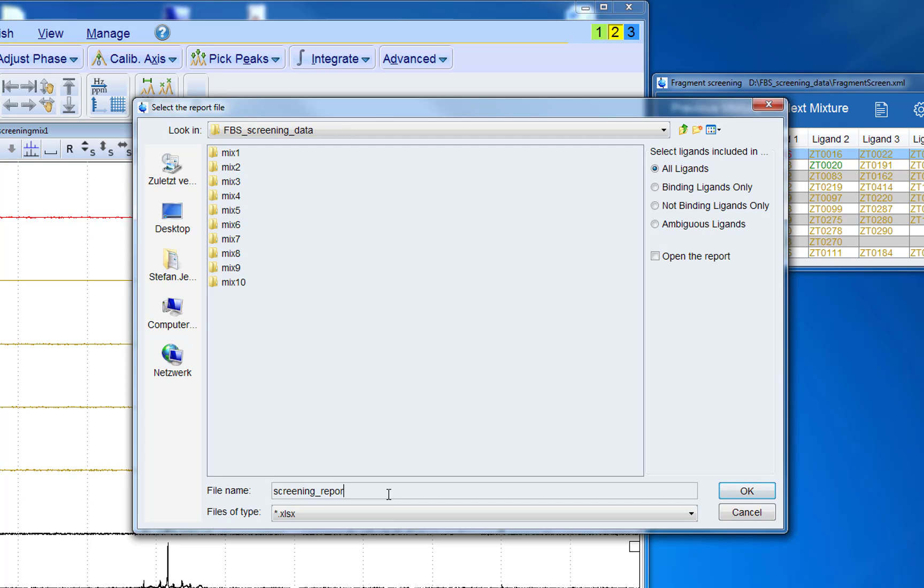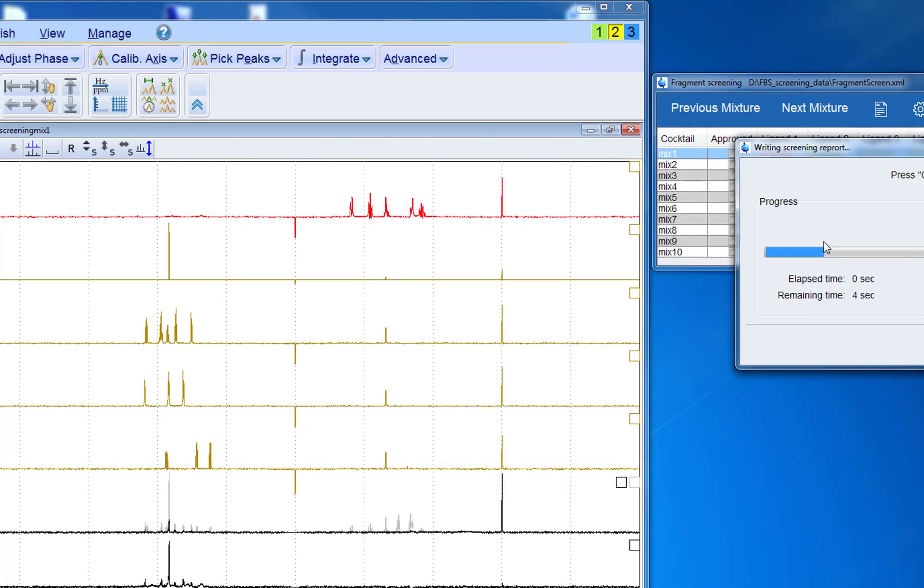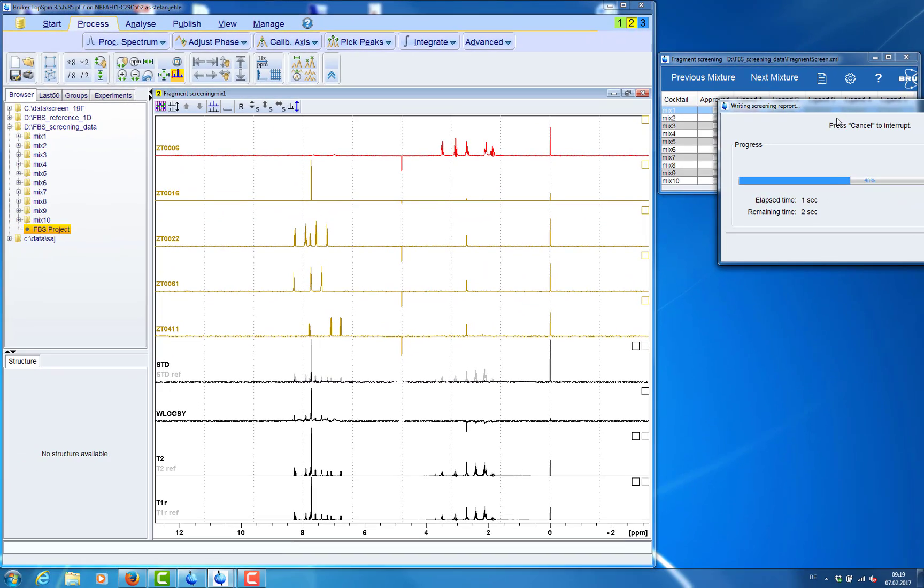We can also choose what information we want to export. Binding ligands only or all ligands. And then we choose to open the screening report and then the excel table will be created.